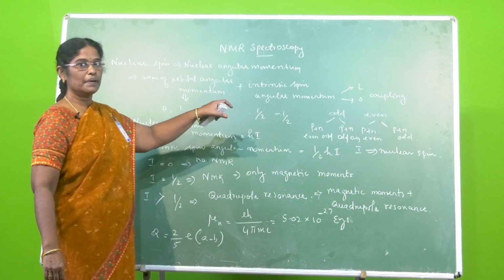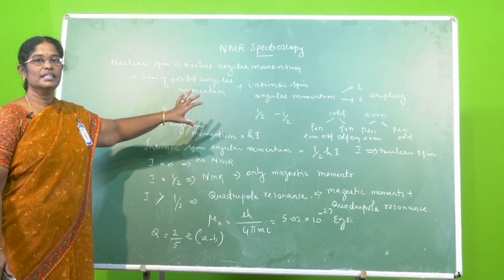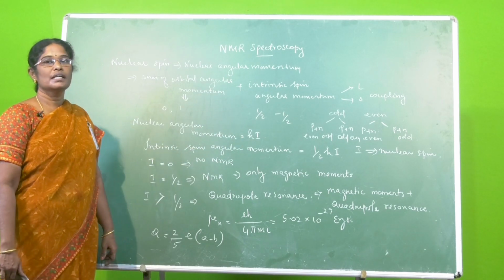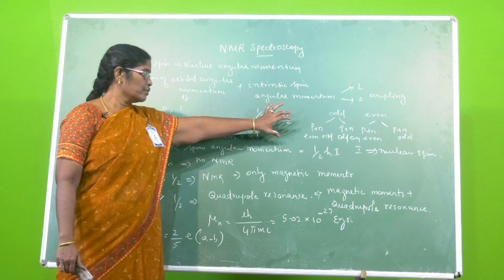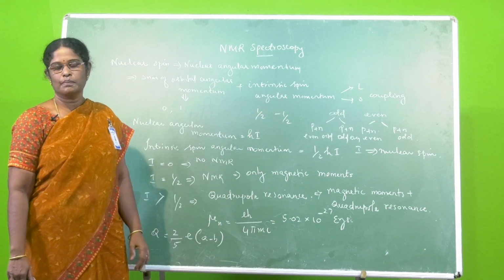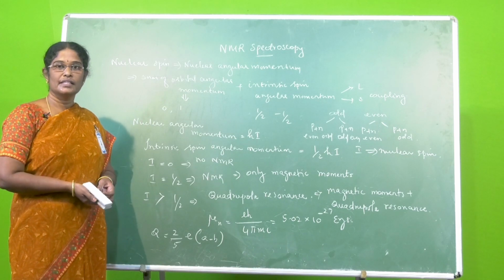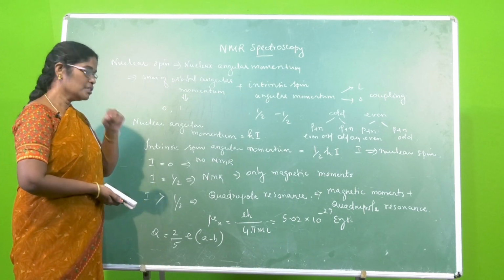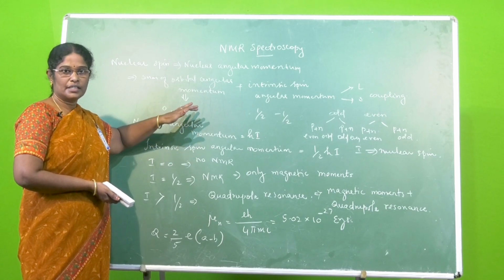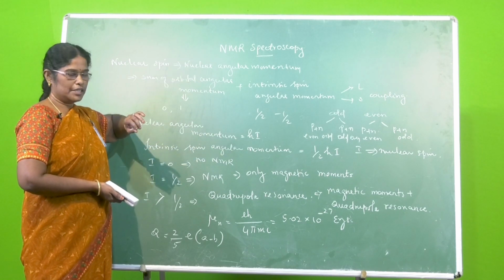So these are the four parameters that occur, or the possible ways of getting nuclear interactions, and it is mainly dependent on the mass number. This will give rise to atomic splitting of spectral lines, or the hyperfine splittings, as we call them, and that is mainly observed in cases where isotopes exist. So we understand nuclear spin and its interaction, and thereby the signals can be computed to observe an NMR spectrum.